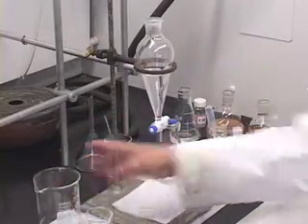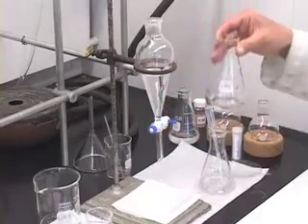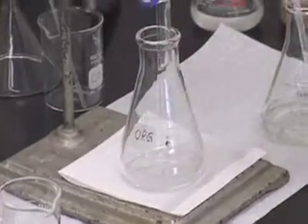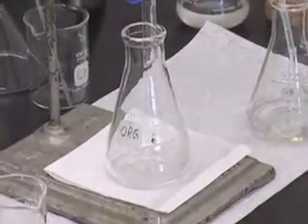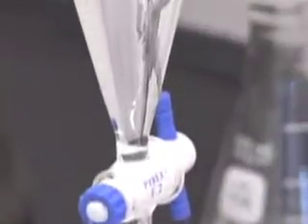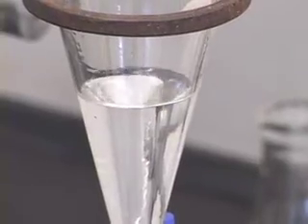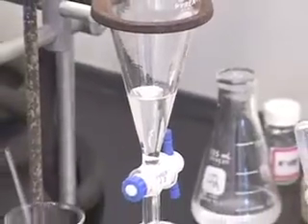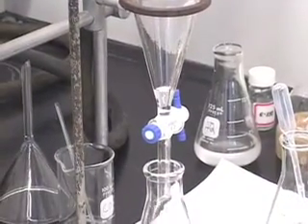Put this waste beaker aside. I had taken this 125 mL Erlenmeyer flask labeled organic. I am going to drain this organic layer into the clean, dry 125 mL Erlenmeyer flask. I can leave this open now — I am not afraid that it will run out, because I have only one layer here anyway. So let us drain all of it.